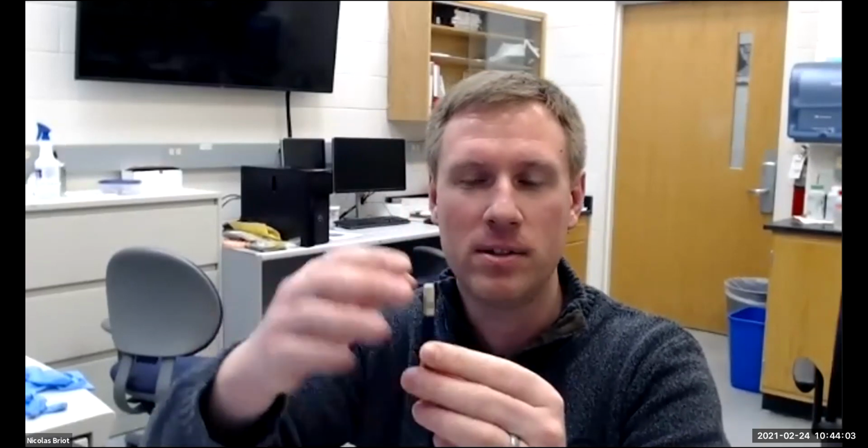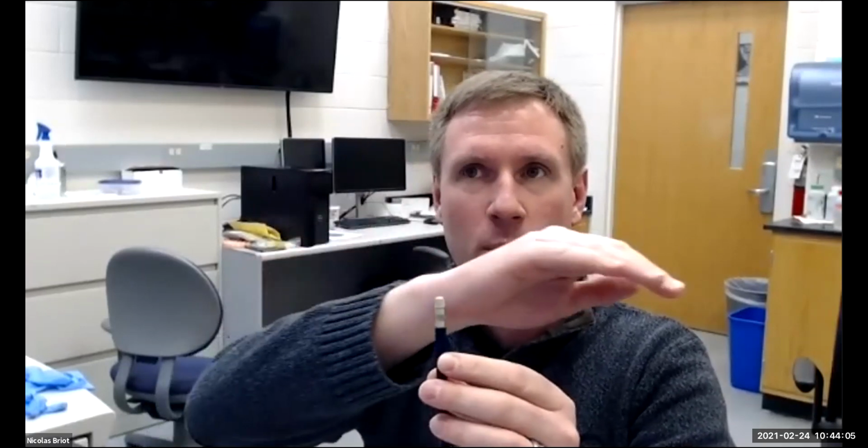Stop sharing for a second. What you have when you embed something into the puck is that at the interface, when you cut and when you polish something, it rounds a little bit. And I mean, it's not much. It might be the first couple of microns, not a lot, but that might be enough in that particular case that it prevents us from seeing that.